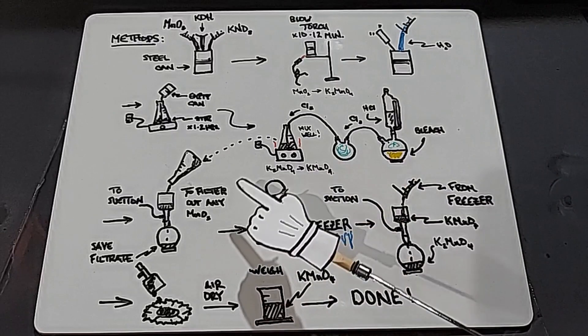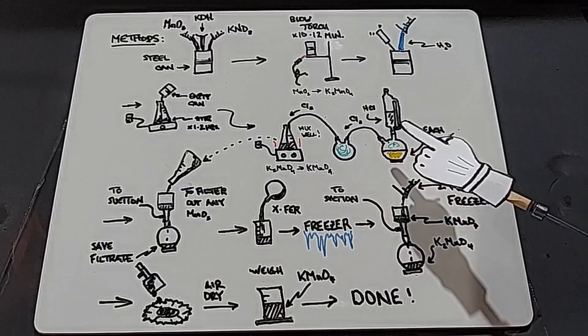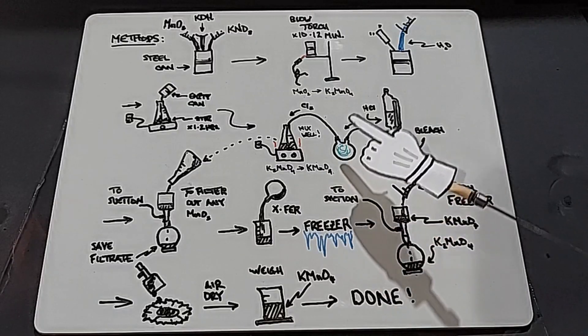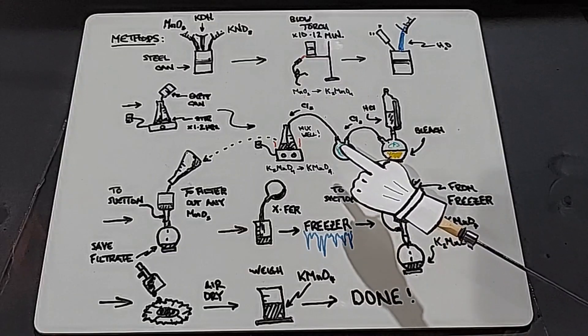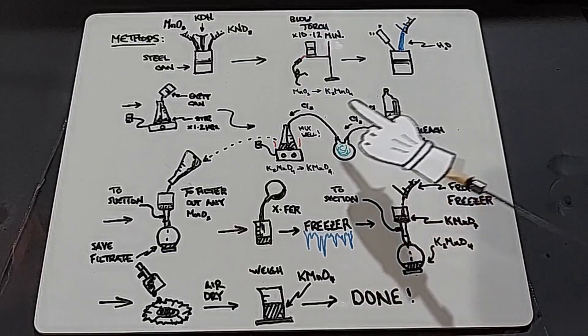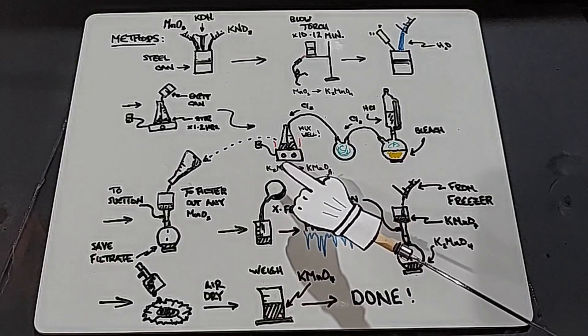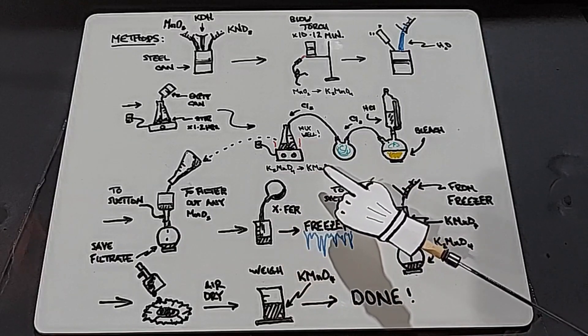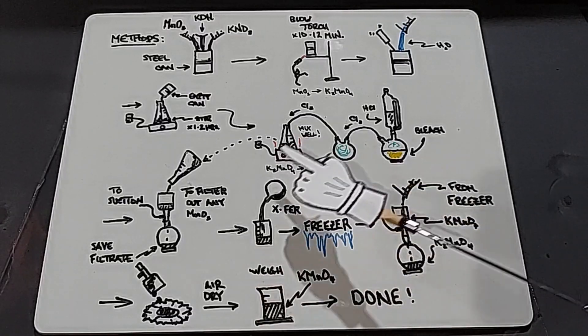Our flask of potassium manganate will get the chlorine. I'm going to have an addition funnel with hydrochloric acid and bleach down here, and a backwash saver just in case. I've done this multiple times and been saved at least once or twice. Once the chlorine gas enters the potassium manganate, it will cause it to lose that electron and become potassium permanganate.